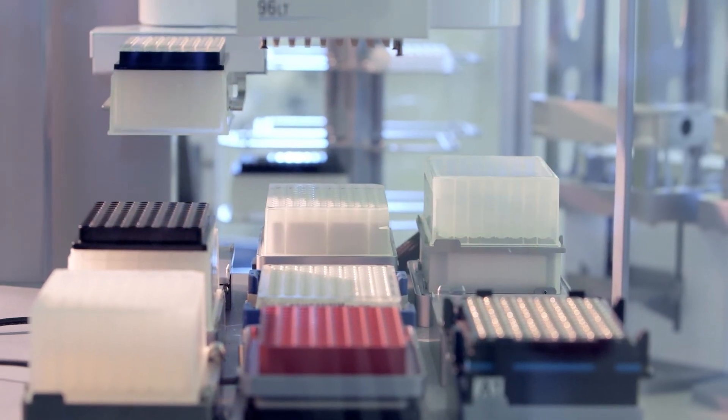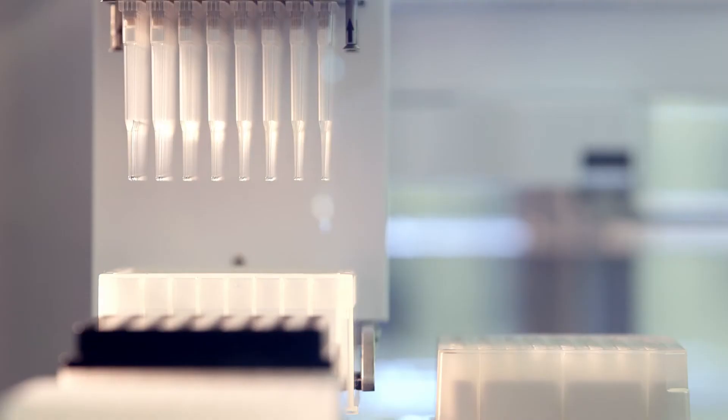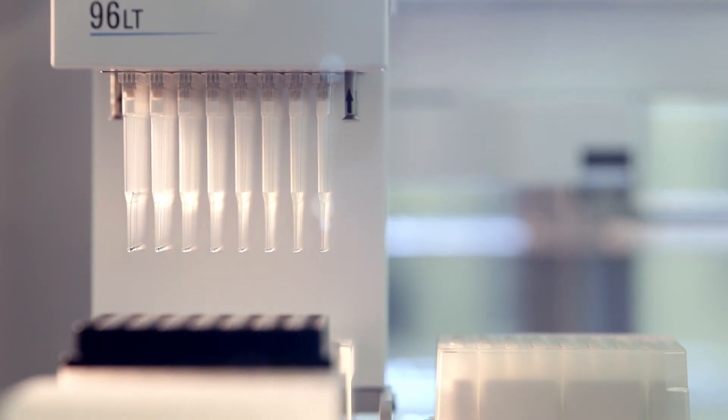These bait sets act much like actual fishing baits as specific sets are used to catch specific cancer genes through their complementary nature.